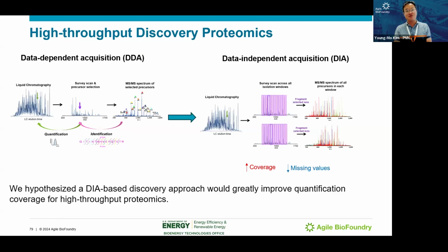Then that is our improvements. Nowadays, all the chromatographic technology and mass spectrometry sensitivity has increased a lot. Previously we used data-dependent acquisition, the more traditional way, but now we can do data-independent acquisition. So we can increase coverage, lower missing values, and also reduce the separation time. We still keep improving this capability to capture more. Next slide, please.